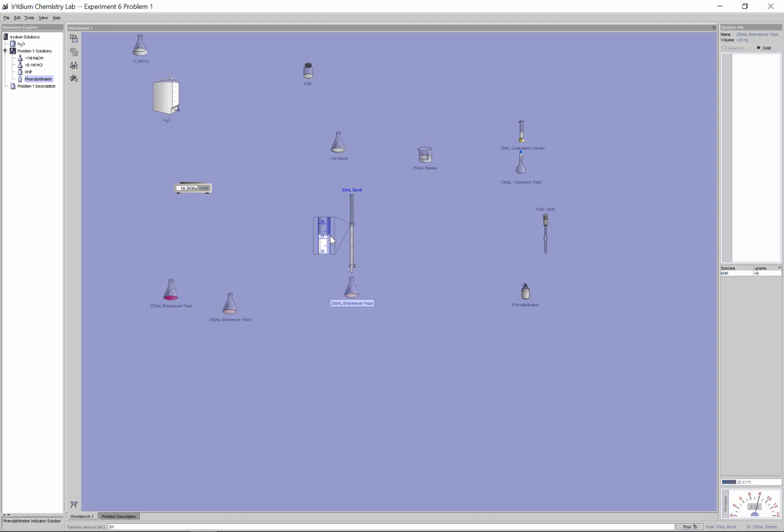In doing those titrations and counting how much acid there is, I'll switch over later on to show you the calculation for concentration. While I have the virtual simulation on here, I'm going to now take this NaOH solution that I've now standardized. I now know the molarity really, really well. I'm going to use this molarity, the 1 molar-ish that I know, and I'm actually going to calculate and standardize another unknown HCl. So this is going to be part 2 of your experiment.